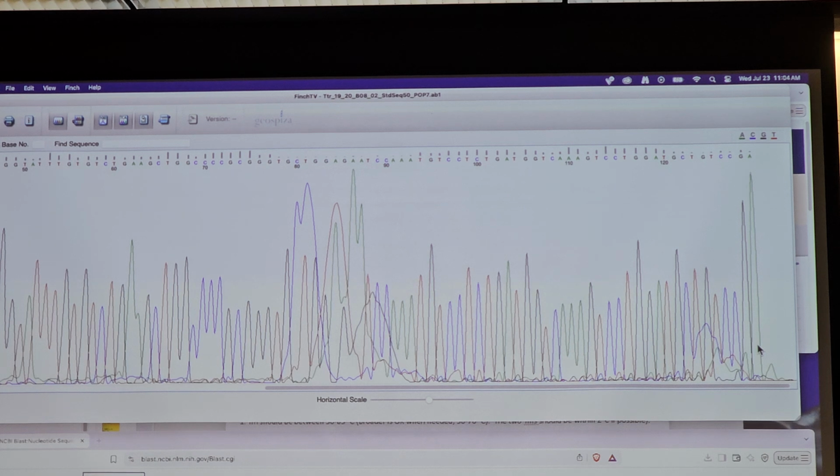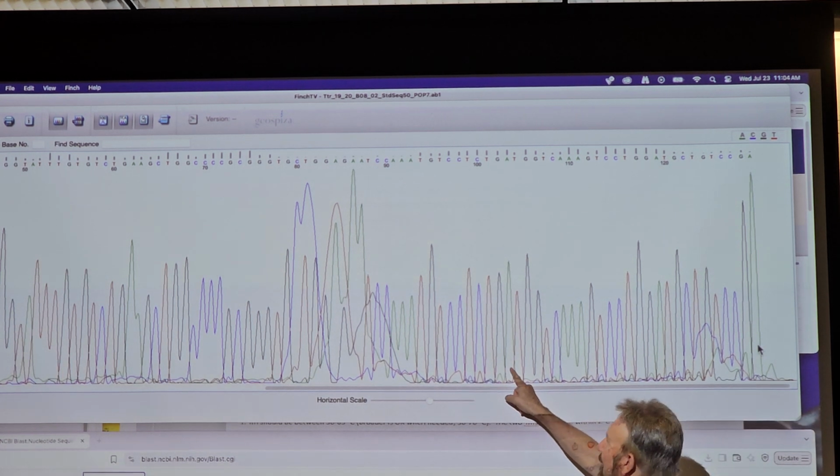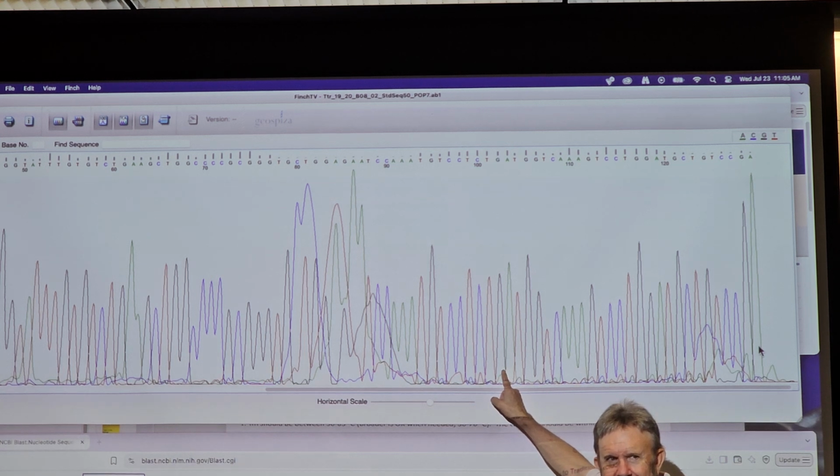Why, on the horizontal axis, do we have a continuous spectrum and not just points for the individual things? I'm not sure I understand the question. Say again? I mean, we have individual bases, right? It goes 20, 21, 22, 23. Yep. Shouldn't we have just a peak at every bin and not a continuous spectrum going up and down? We have stuff in between the bases.